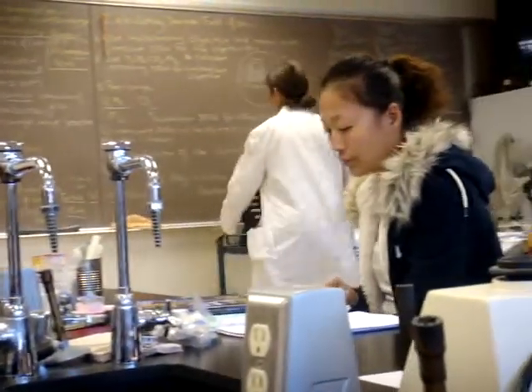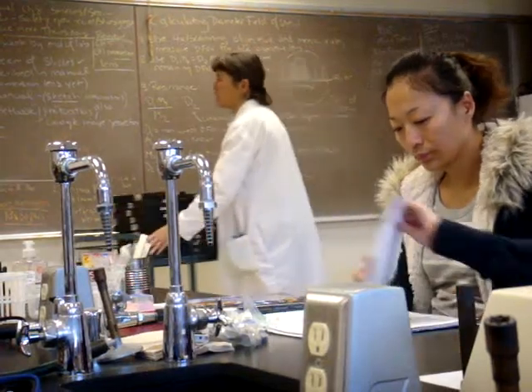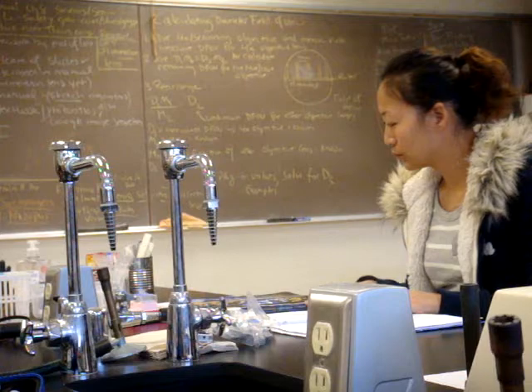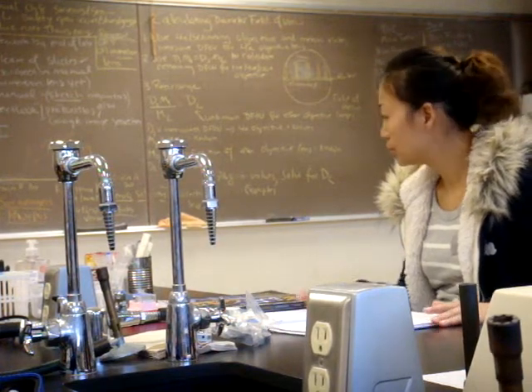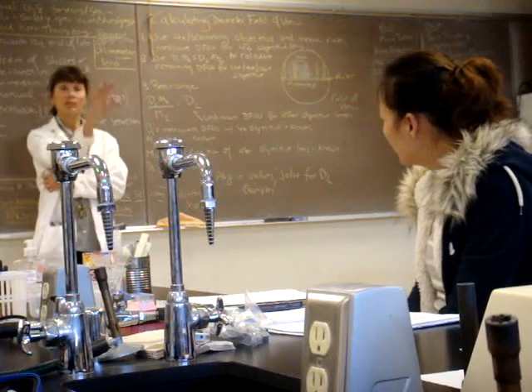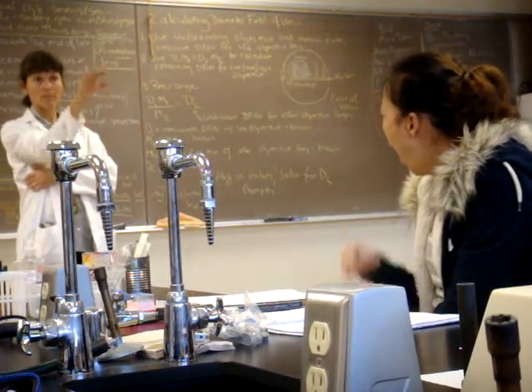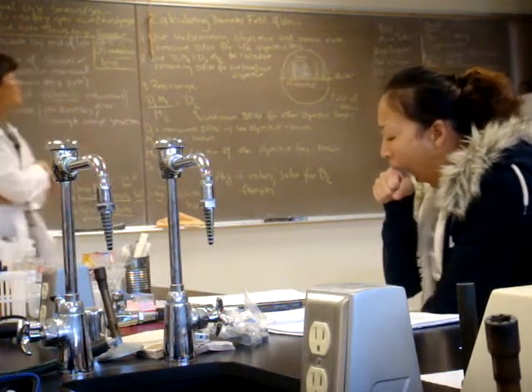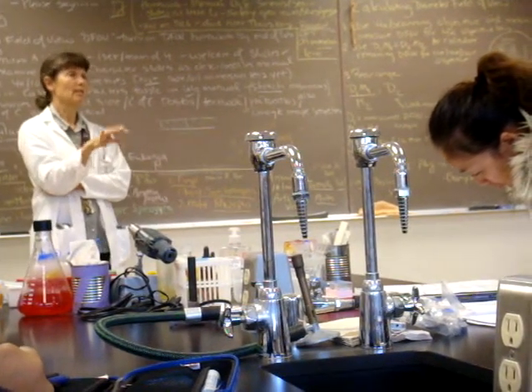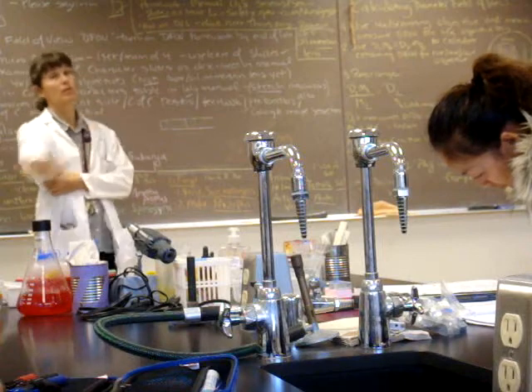All right. So if you can get out your little worksheet, the diameter of the field of view worksheet that you're going to be turning in by the end of lab. Hopefully you had a chance to look at it. Hopefully you did the practice problems there, the first couple of problems. And what we're going to do is walk through how you're going to calculate the diameter of the field of view for all four of your objectives.